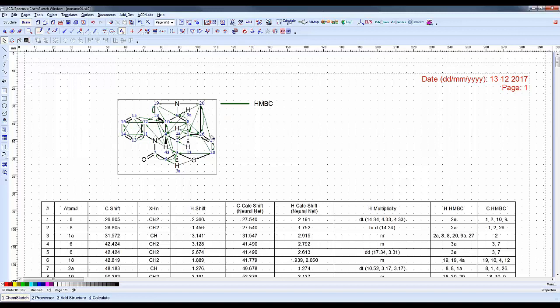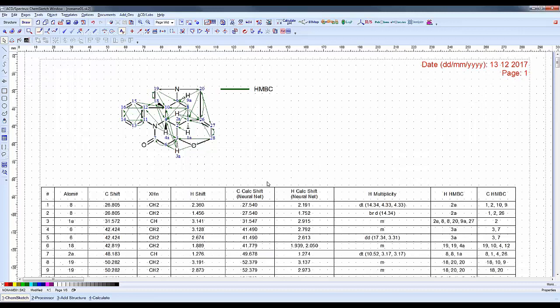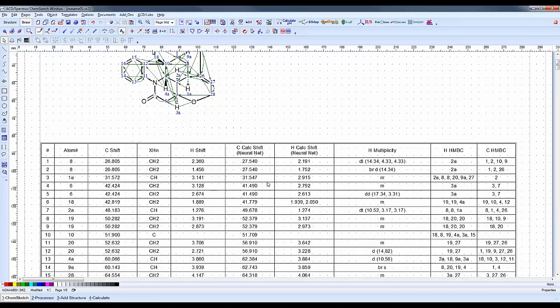We have our structure with our HMBC correlation arrows on, done automatically for us. We have our date, our table summarizing all our data.